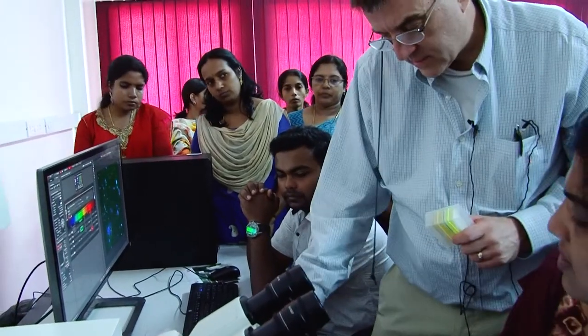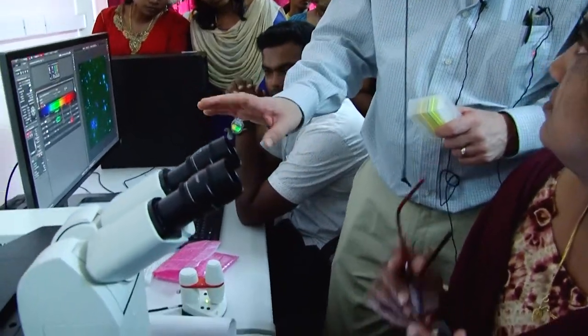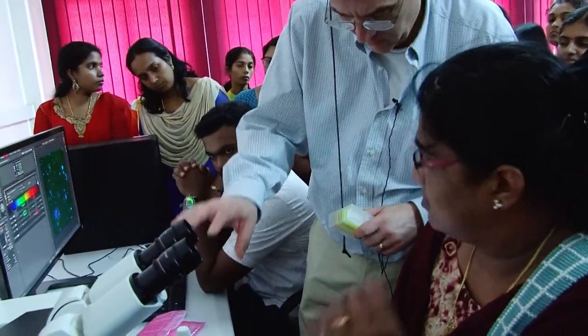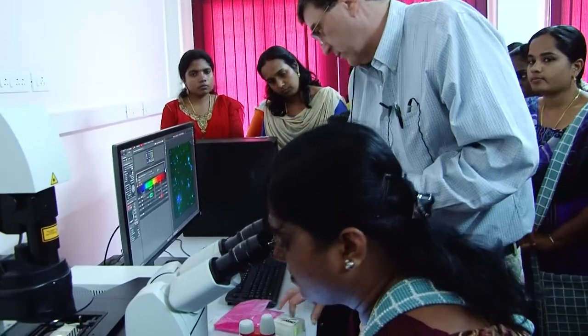So use this. This is X and Y. Focus around. Find something you think looks pretty. And then this is the focus. And once you find something you think looks pretty, put it in the middle. Try to get it in the middle as best you can. Focus it. And then we're going to show a little bit different something with the confocal.